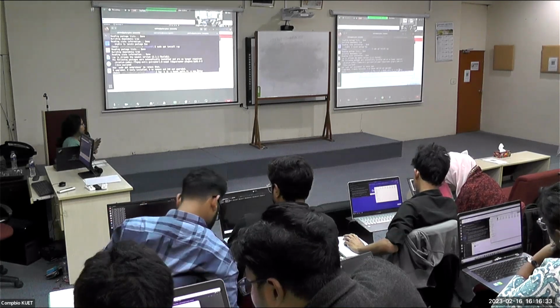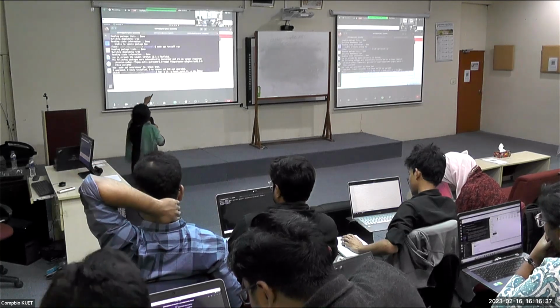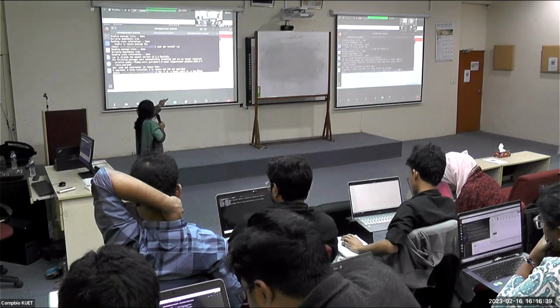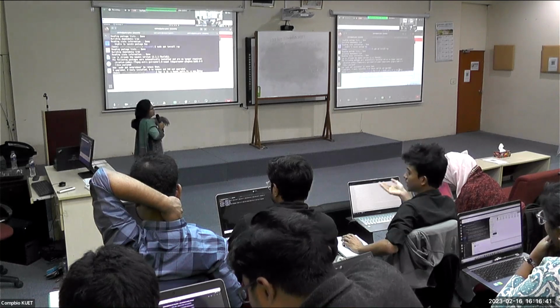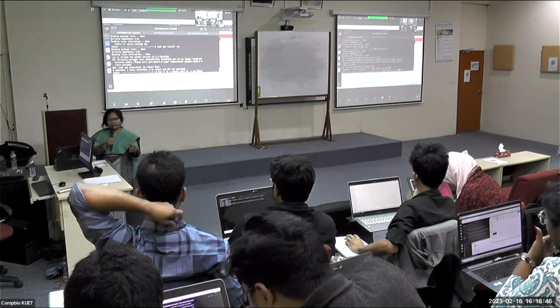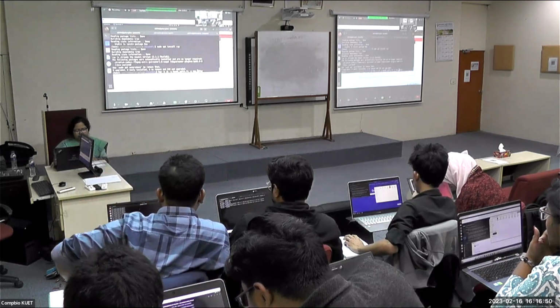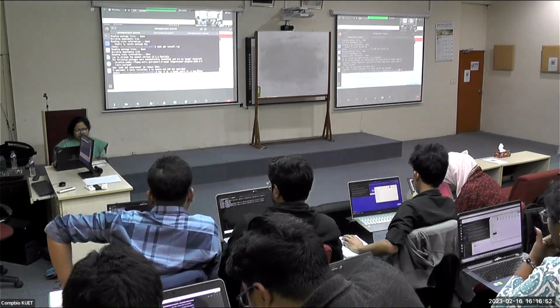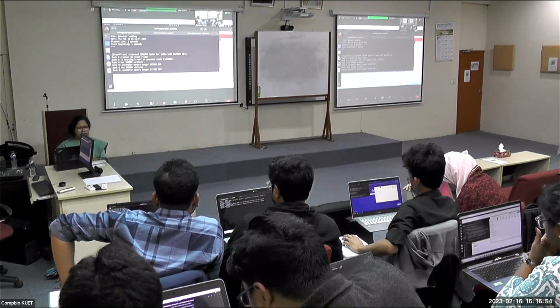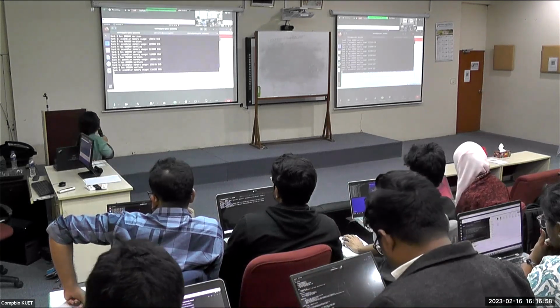So this is the Ray assembler we are using, and we are using 31-mers. Then -s for the sequence file is read_split, and -o is the output folder, which is a new empty folder. So if you could write this and then just press enter and see how it is working. It's showing what it is doing.